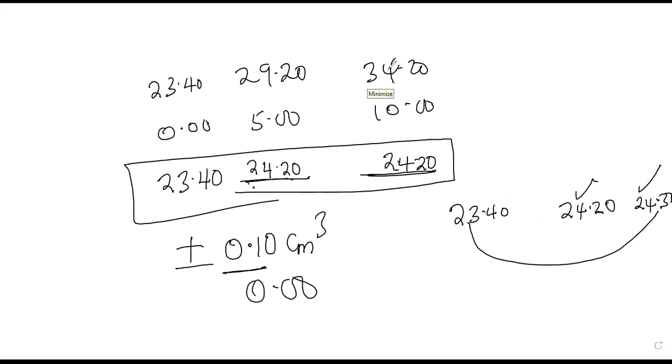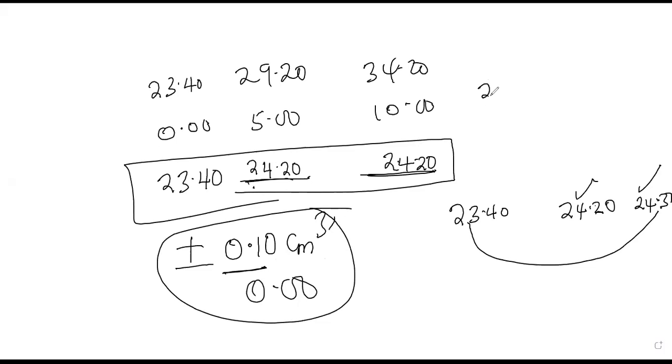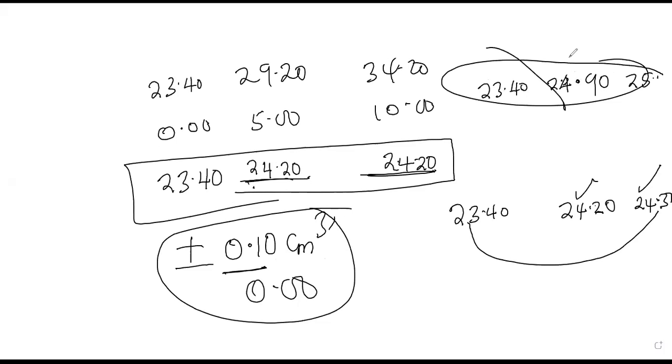All right. Now, that pair is chosen according to this consistency. You should get those values which are consistent. Now, a student who records the final values as 23.40, 24.90, and then takes us to 25 point, this one has not done a practical. You get a 0. Better lie if you can't. If you have this in mind, you can better lie and get the marks of the table, and you lose the one of the average.